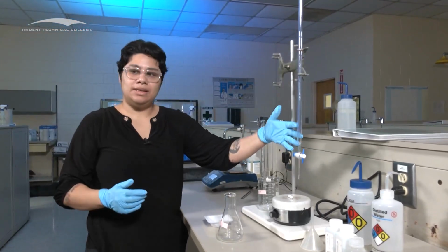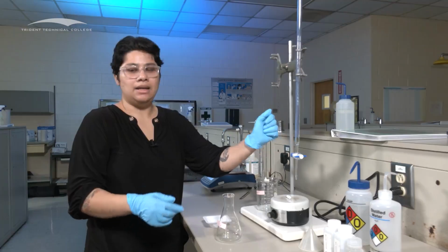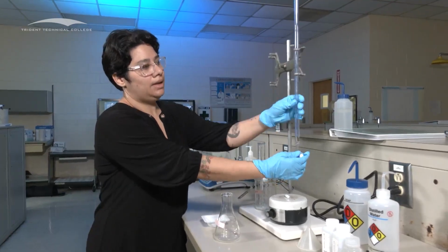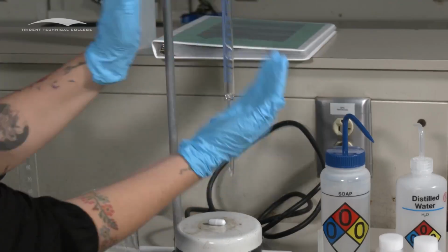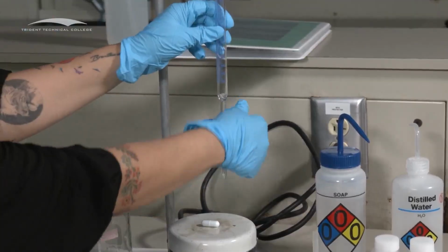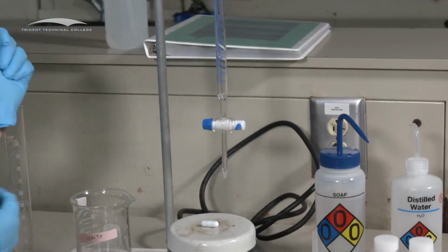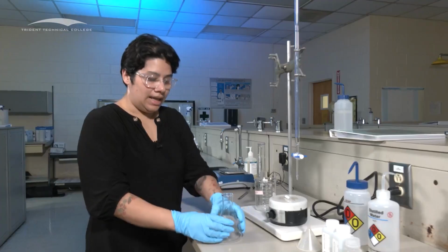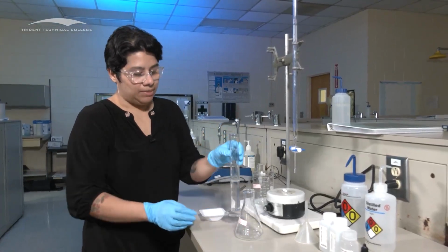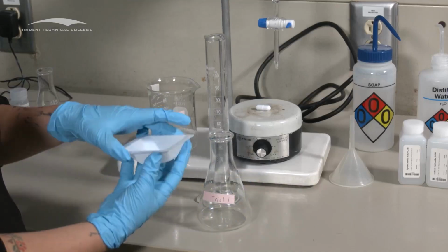And then right now, this is open, so you wanna close it. You wanna go all the way like this. So when you're looking at it, if the stopcock is parallel to your burette, it is open, and if it's perpendicular to it, it's closed. This is not closed. It has to be all the way like this. And then I already pre-measured my 50 milliliters of water. We're gonna put this in here.